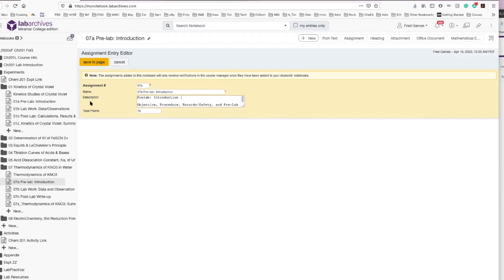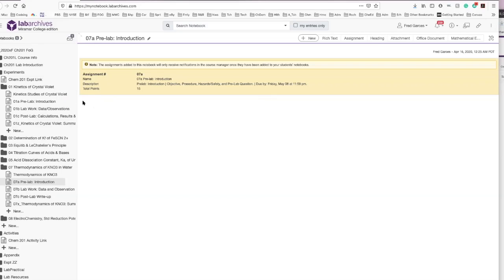See how there's nothing on this page, but if you hover, you guys can insert a rich text file, and then on the rich text file you can start editing.